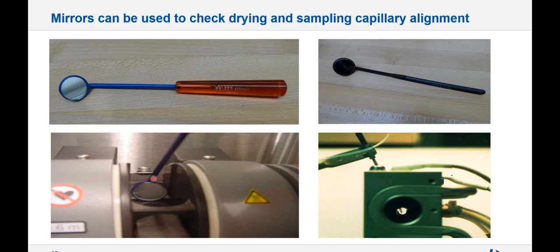And you want to see the vapor within 15 seconds of the first step. You want to stay at the first step as long as you see vapor. So you don't want the first step to end before the vapor is ended. Then you'll go into the second dry step.